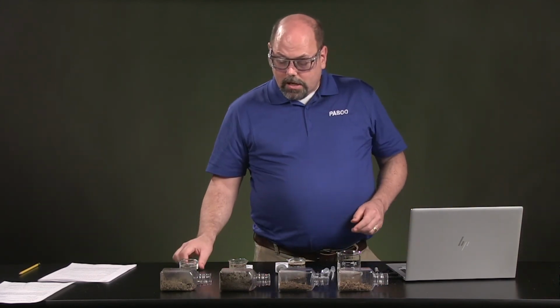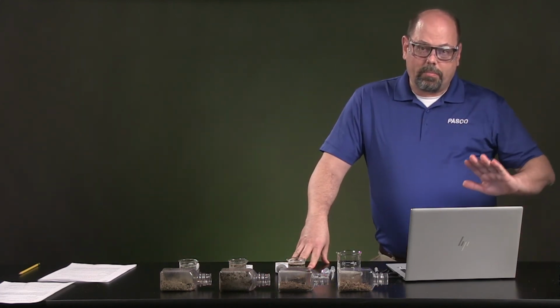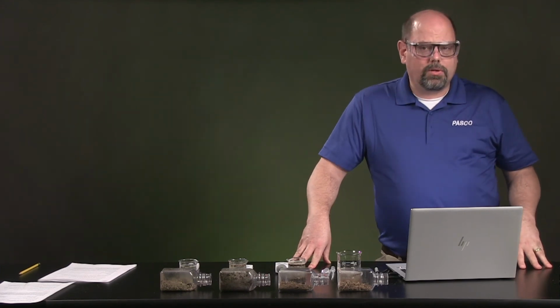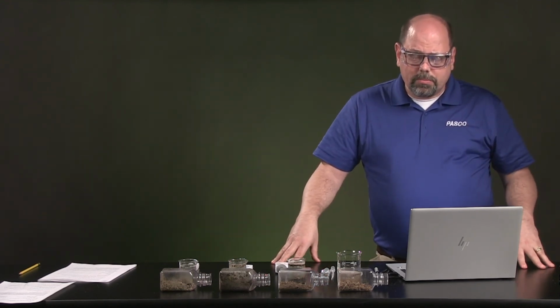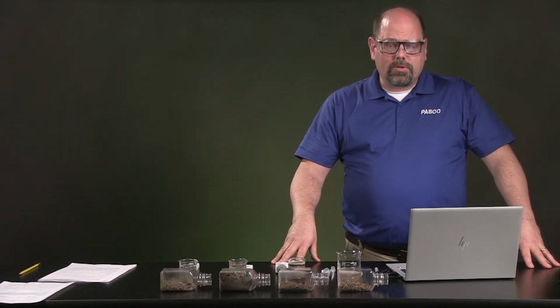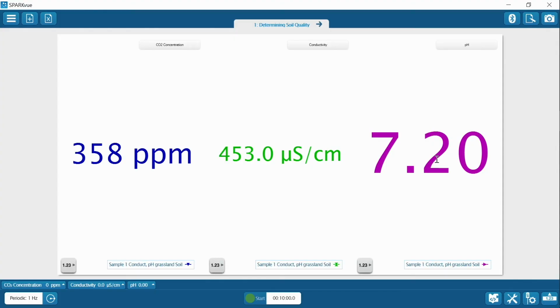The pH sensor is going to measure and determine whether it's more basic, higher than 7, which means it's going to have some more limestone kinds of components. Plants, especially in the middle of the United States where the old shallow ocean used to be, as the continents were forming, had deposited a lot more limestone in those times, and they would see that their pHs would go higher than 7 because it has the limestone as a lightly basic component.